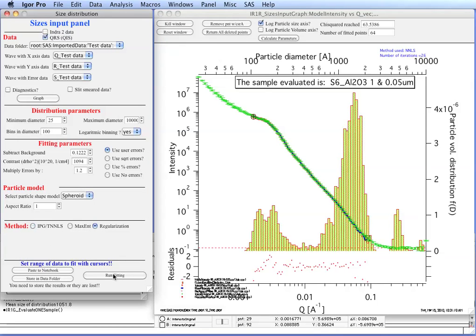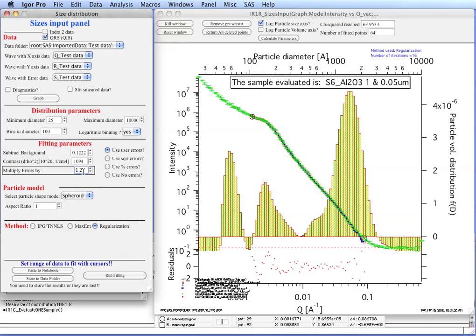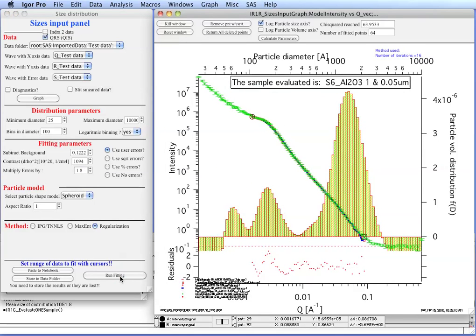Regularization often fails. It has no parameters. If you do this, you can see that you have a result which is reached very fast. But what you can see are these negative volumes, which of course are not particularly physical. You can play with the error multipliers to see if you can find a better solution. And you could arguably say that it gives approximately the same things. Sometimes it gives a large size here and something about small sizes here. But my experience has been that this is not a particularly usable method under most circumstances.